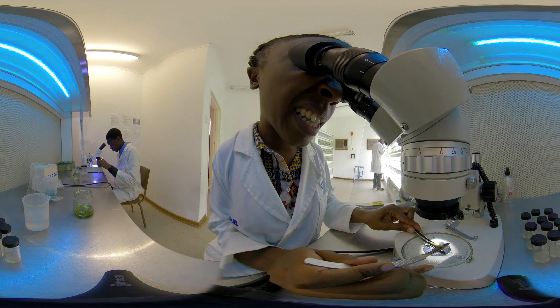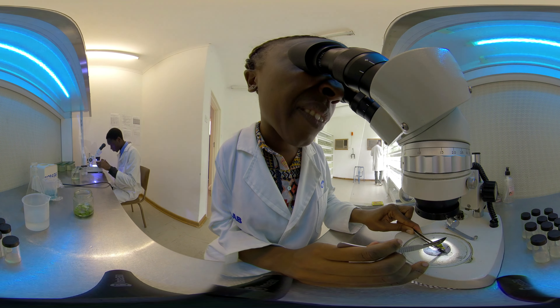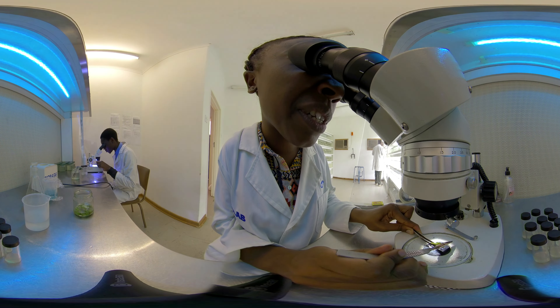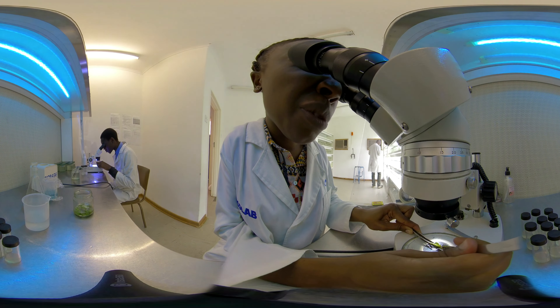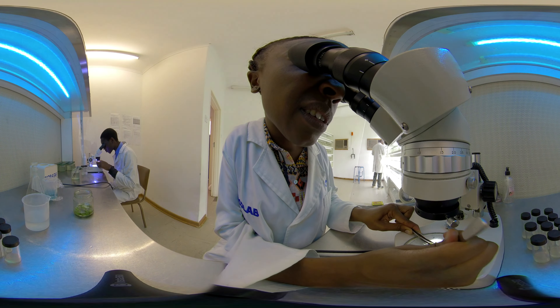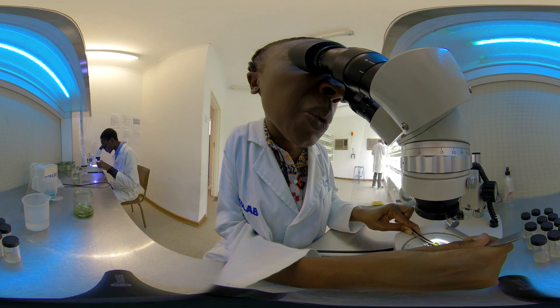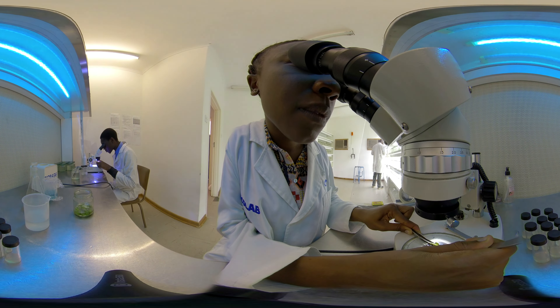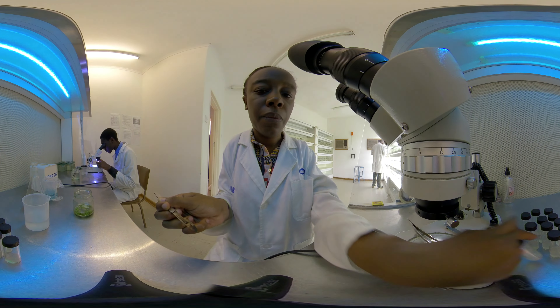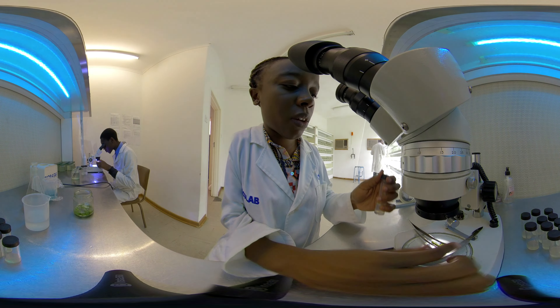Now I will dissect my meristem tip from the planting material using a stereo microscope. The reason why we dissect the meristem tip specifically is because it is the only part of a plant that is virus-free. Once we have extracted our meristem tip, we can culture it and from that meristem tip grow an exponential amount of virus-free plantlets. We use a stereo microscope to dissect our meristem tip, and once we have isolated it, we then culture it in our prepared media. And that is our cultured meristem tip.